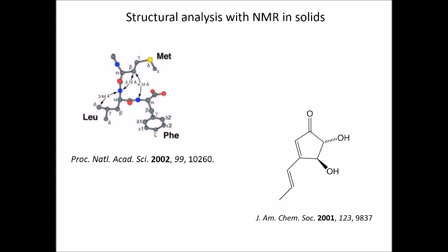Another molecule appeared about the same time. It was a smaller fungal product, and this was characterized at natural abundance. So it's been possible for about 20 years now to do structural analysis in solids with both labeled and unlabeled materials.